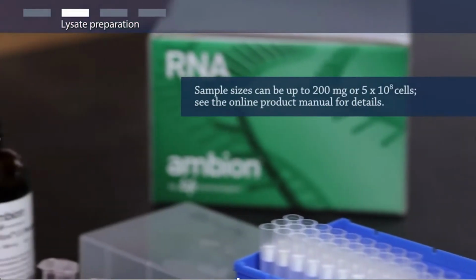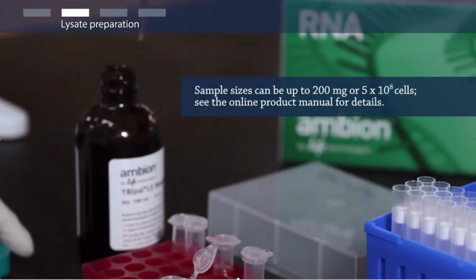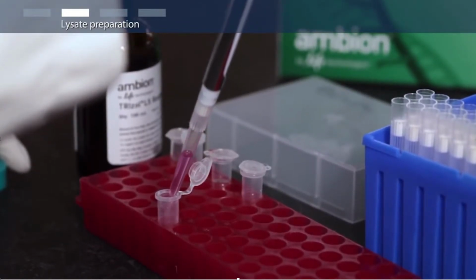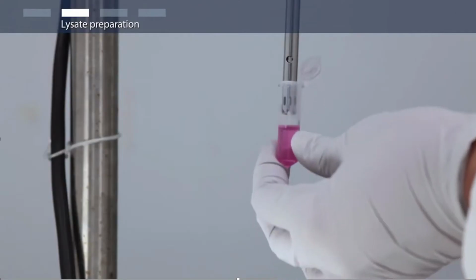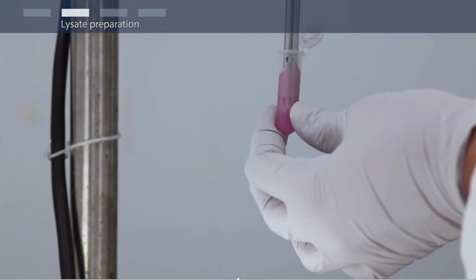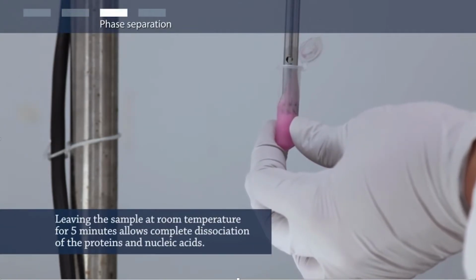You can start with 50 to 100 milligrams of fresh or frozen tissue or cells. Add 1 ml of Trizol reagent. Homogenize thoroughly using a tissue or rotor-stator homogenizer. Let the sample stand at room temperature for 5 minutes.